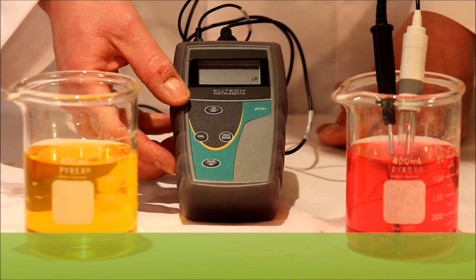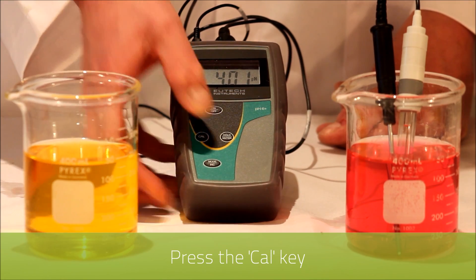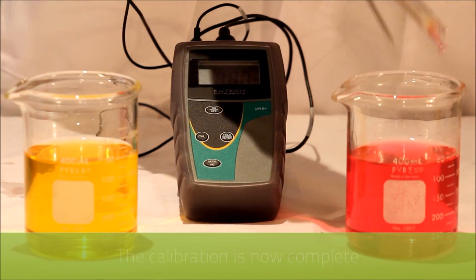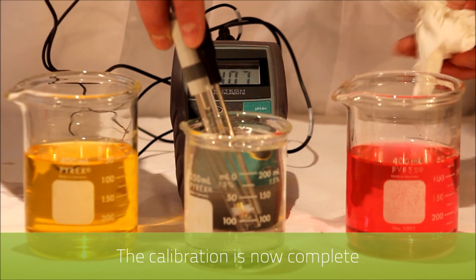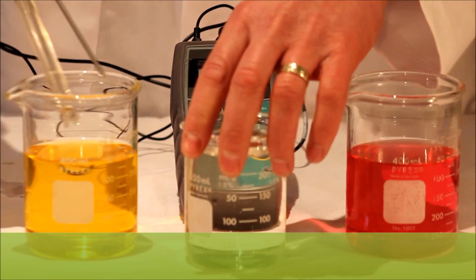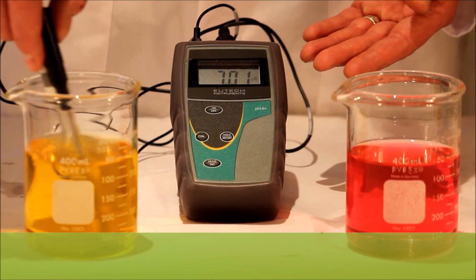To end this process and enter back into measurement mode we press the CAL key. As you can see the measurement is correct at four, and we'll clean in deionized water. We then submerse into seven and we have the correct reading.